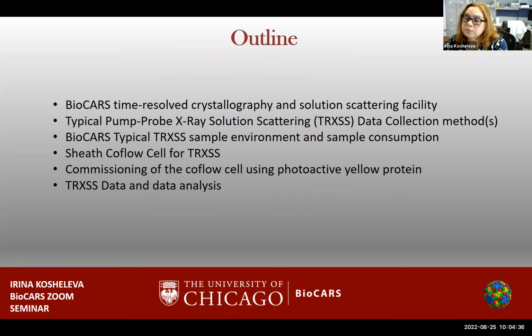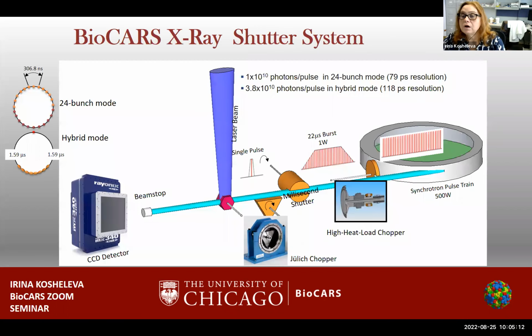The outline is pretty simple. I will speak a little bit about our hardware, about typical pump probe X-ray solution scattering methods, about current BioCARS time-resolved solution scattering sample environment and sample consumption. I will describe the co-flow cell and how it was commissioned and how data is comparable or not comparable with time-resolved data, which is collected using standard methods.